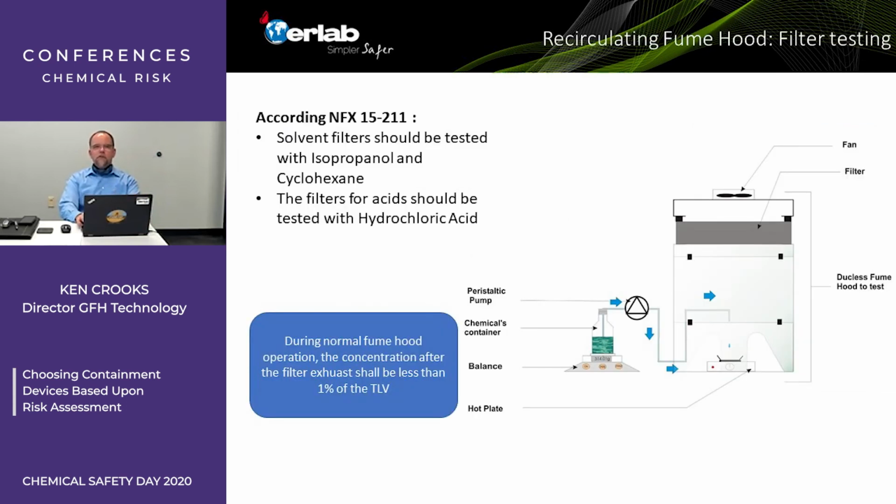So we do have modified test procedures so that you can generate IPA in the field, and ASHRAE is actually changing, the ASHRAE 110 standard is changing to that test protocol in the next year or two anyhow. So that's good news. Now, you want to choose, obviously, filters that are appropriate for the application, whether it's just solvents you're using or if you're also possibly using acids and bases.